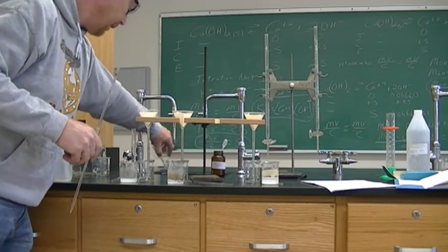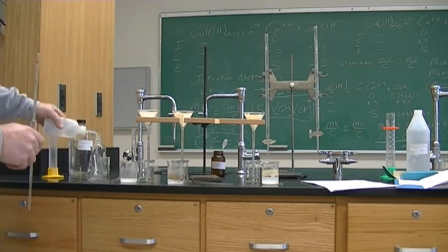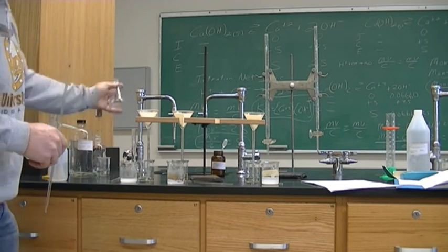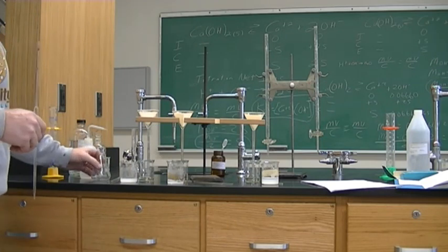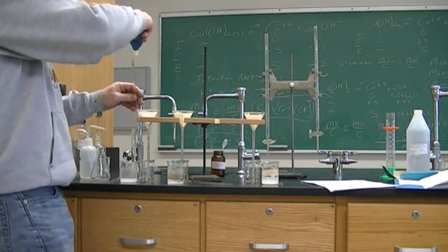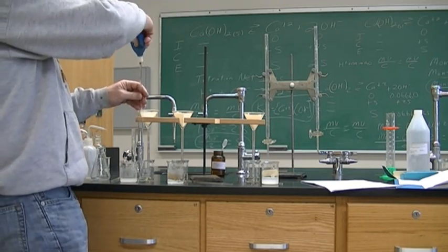It can be distilled water wet, because we're going to do a titration in distilled water. We checked it already. It is neutral. It's not adding acid. It's not adding base. But we need to get exactly 10 mils out of here. Let's see if we have filtered enough to get 10 mils out of here.